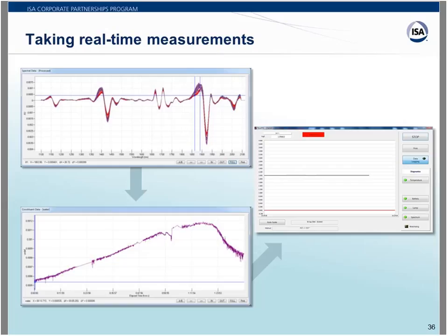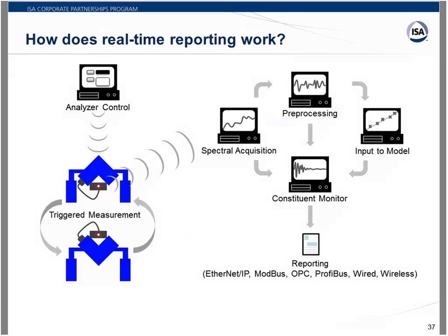Right now, I can sense that some of you are about to max out from the model building process and the chemometric procedures. So before you're exhausted, I would like to show you a schematic representation of how our real-time reporting works during a production process. In slide 37, you can see an elaborate scheme of how we acquire spectra from a sample under production within a blender, which is highlighted on the bottom left-hand side of the slide in blue color.